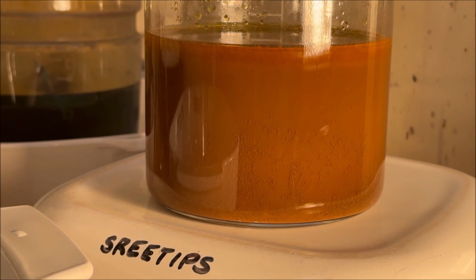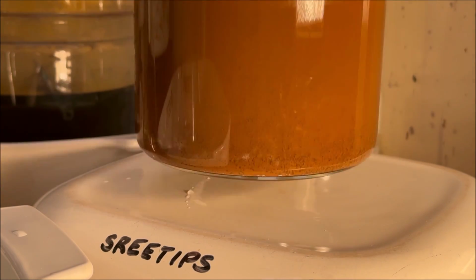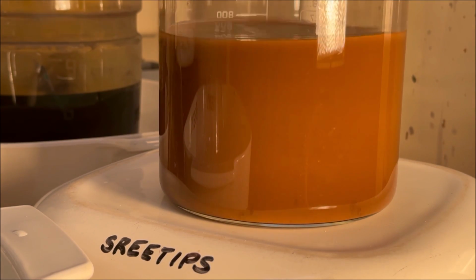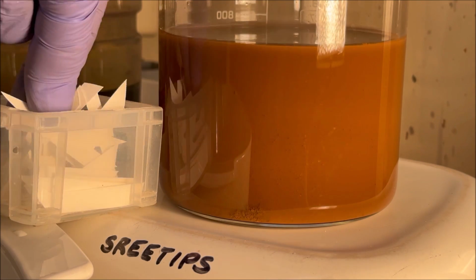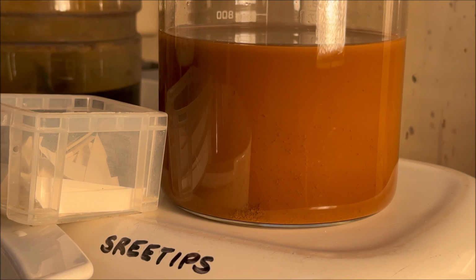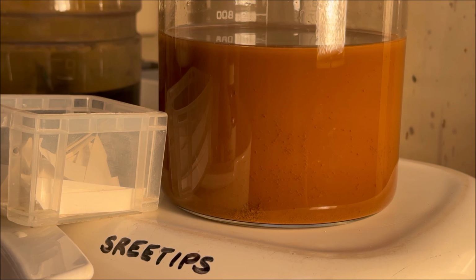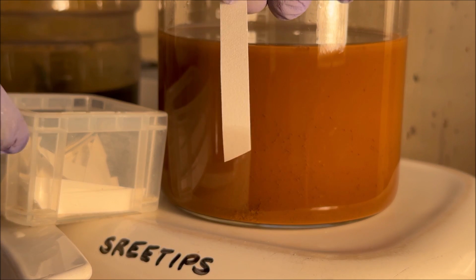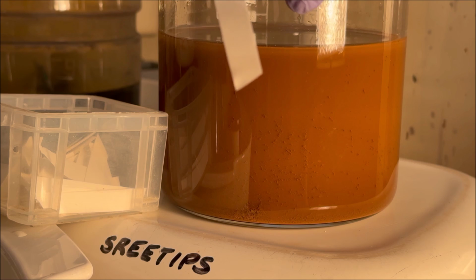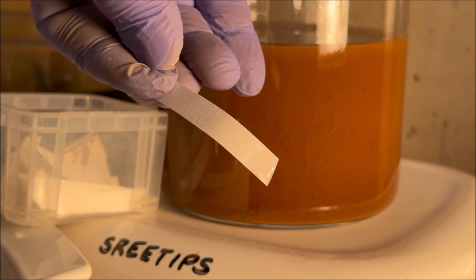I see some yellow around the top here. Just put another quick spoon of stannous, or I mean another quick spoon of SMB. Now what we'll do, get a stannous test. These are pieces of filter paper that I cut up. What we'll do is stick this down into our solution. Do a stannous test, make sure all the gold has in fact dropped out of here. And as you can see, that negative stannous test tells me all the gold has dropped.